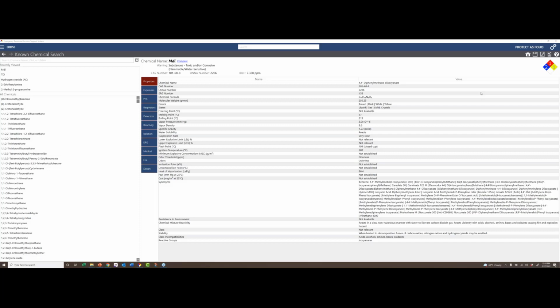So for some things that are phosphorus containing, it only measures down by permissible exposure limit and not up towards IDLH. When I look at these things, I try to get a kind of a blend, and I should have put a slide in here, but I usually put in that continuum of interest. So the permissible exposure limit up to the IDLH and even up to the lethal concentration if necessary, and show which detector is hitting in each area. So the AP4C is going to be at that low end usually if it's in phosphorus or sulfur channels, and it's going to be in that mid-range if it's on nitrogen channels.